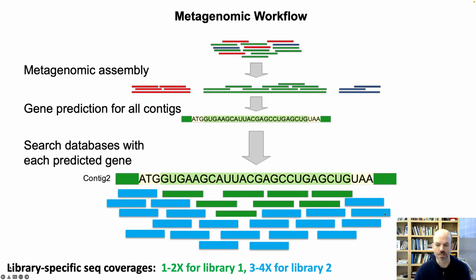Library is a more technical term in the sequencing world to represent the actual collection of DNA that you gave to the sequencing center, because at that point you're actually a few steps removed from the sample. Nevertheless, in practice, we often just say sample because it's more common to say sample than library. But library is the thing that you make from the sample.